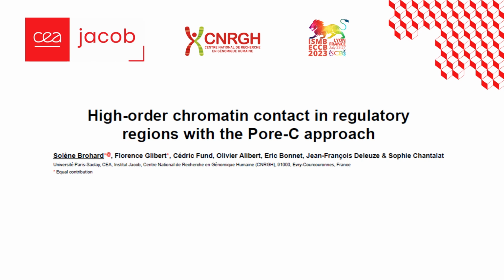Good morning, everyone. I'm Solène Brohard, and I'm part of the CNRGH, the National Center of Research on Human Genomics in the Laboratory of Bioanalysis. I present my poster on the study of high-order chromatin interactions in regulatory regions with the Pore-C approach.